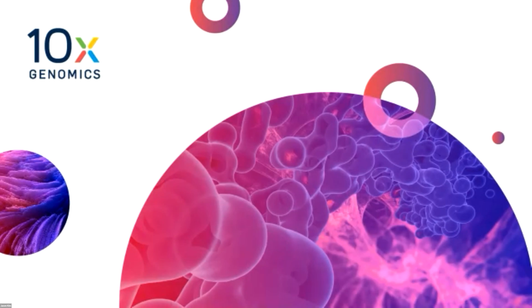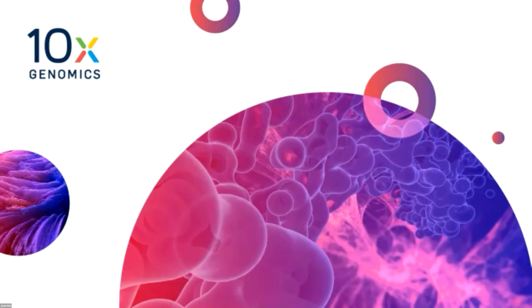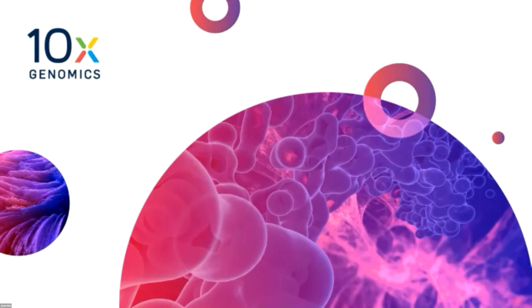You just wouldn't have the level of resolution that most people would want, say, a more single cell type of resolution, or at least in a compartment that allows for more quantitative analysis. So I think your two barriers there would be trying to design an RTL-like approach to the bacteria that you are focusing on. Well, I guess that's why I was thinking, wouldn't it be more compatible with the cryo sections where you don't need the RTL? Well, the problem is that it only captures indiscriminately poly dT, anything that has a poly A. So right, fair enough.